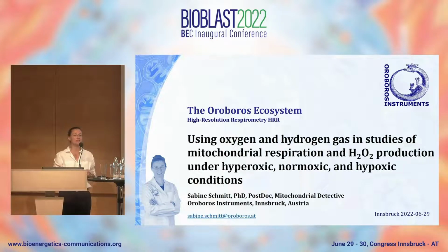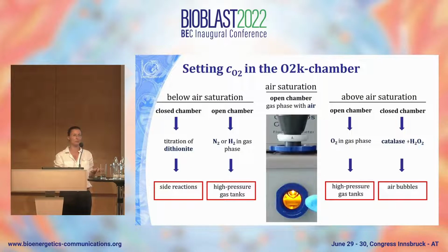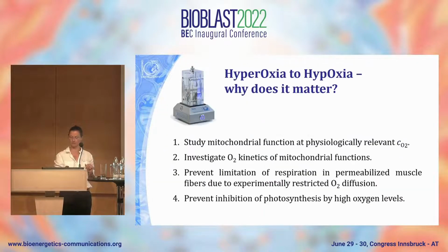So I think we still can skip this. I will not go to the definitions, but we heard a little bit that hypoxia, normoxia, hyperoxia is at least related to being above or below something. So why should we care about it when we measure in our experiment, in the experimental chamber?